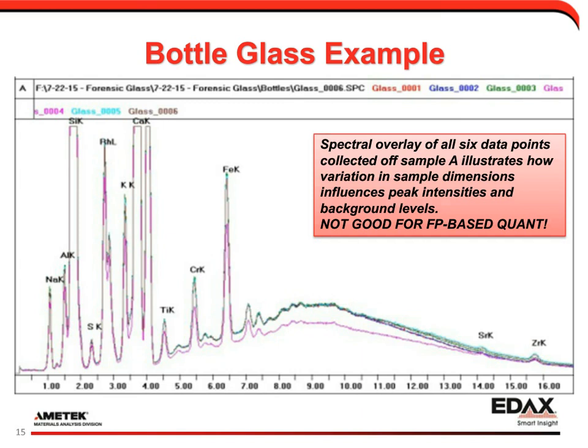You can clearly see variation in, for instance, the iron, variation in titanium, chrome. Background level is substantially different for one of the spectra. So just looking at the qualitative data, we cannot really determine, with such a variation in sample size and thickness, whether this is really due to actual variation in composition, or just due to the influence of the actual sample dimensions.